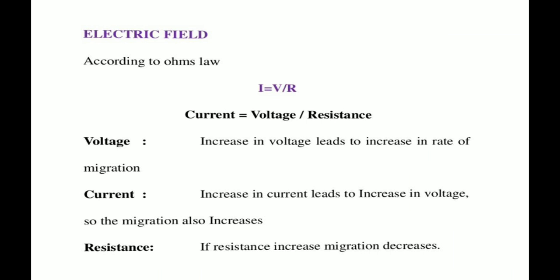Okay, so voltage: the travel time of the molecules being separated is affected by the voltage applied. म्हणजे जो काही मॉलिक्युलचा travel time आहे तो affect होतो by applying a voltage, meaning increase in voltage leads to increase in rate of migration.